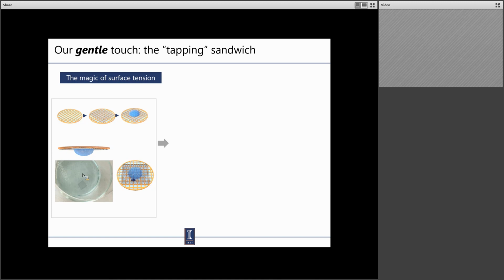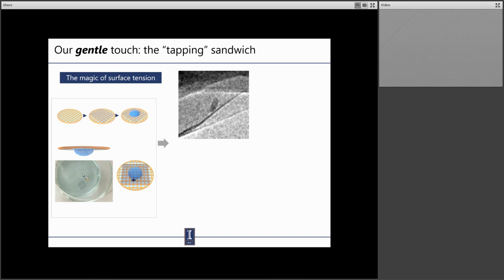And then based on this method, we got a liquid phase TEM movie. It's actually the first ever TEM movie of a moving and fluctuating protein sample of a nanodisk. Here the black feature is a nanodisk. You can actually see it's moving and rotating freely in solution, exhibiting a disc-like shape as your eyes do the 3D reconstruction for you automatically.